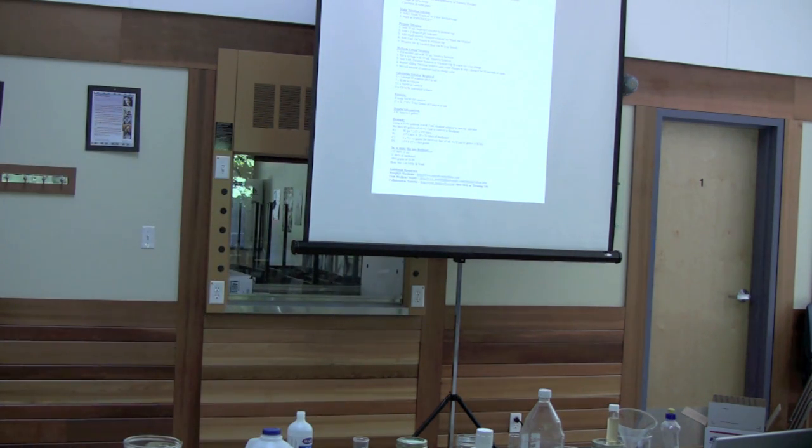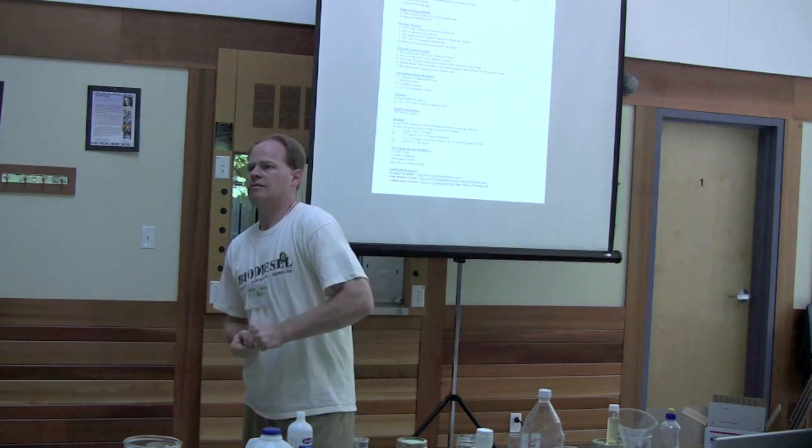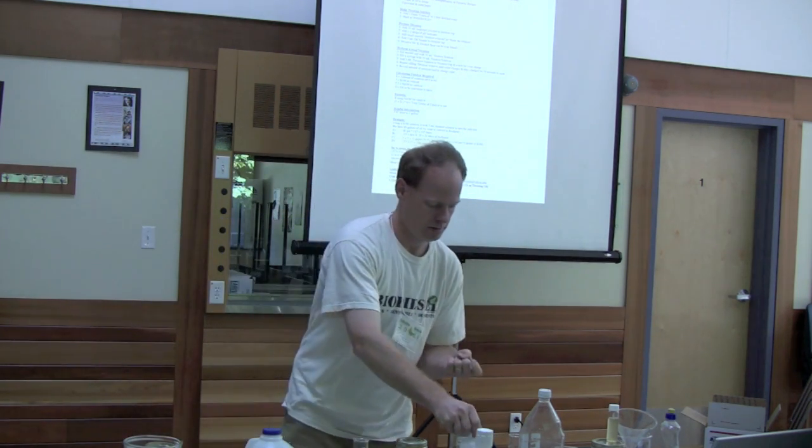It's over here. There's stuff out on the table. The cold flow module will be out shortly. It's $750 per test. The total glycerin is the tube test, and free fatty acid and acid number is about a $750 test. We're working on a bunch of other things.